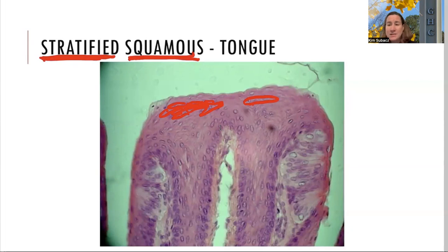What is their job? It's the tongue, and we are going to ingest possibly abrasive food or really hot food. Maybe you had a really hot tea or hot coffee or some hot food, and we want multiple layers. If we just have one simple squamous layer on our tongue, that would not provide a whole lot of protection. So we need the stratified layers because they are going to give us all sorts of protection. So this is stratified squamous epithelium. We find this guy on the tongue. Its job is to protect, and it is specifically the non-keratinized epithelium there. So this one's on the tongue.